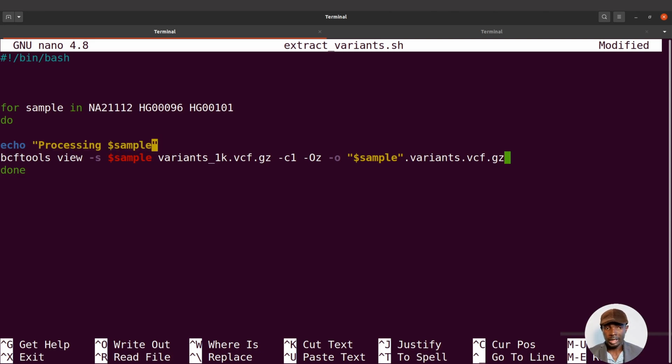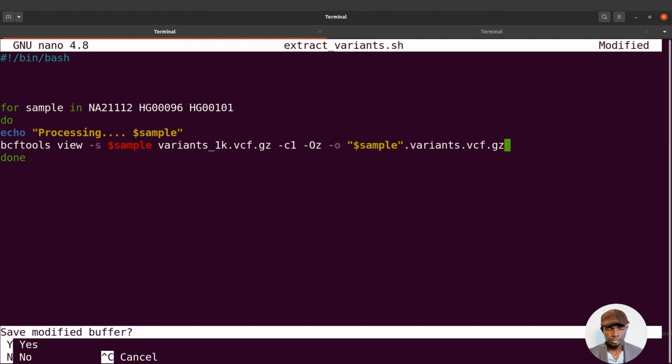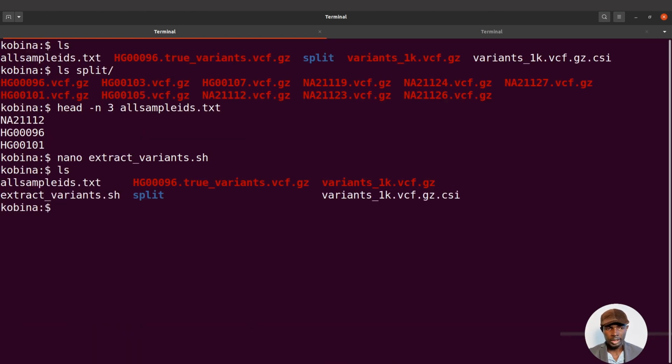You can also experiment by adding other characters here. It's up to you. It's time to get creative. Just go all out, it's fine. So you can do something like this. All right, and then you can edit and save changes. And after that, you can do an ls. You find your bash script, which is this one here.